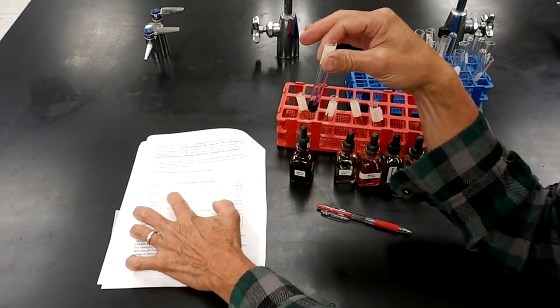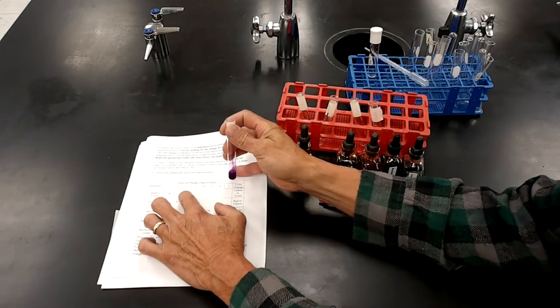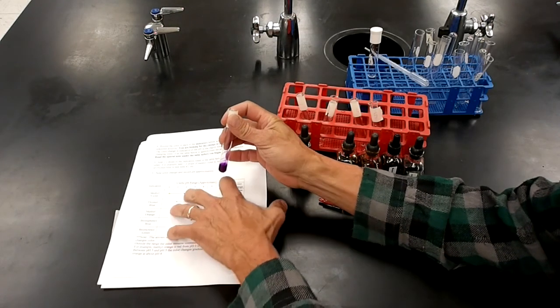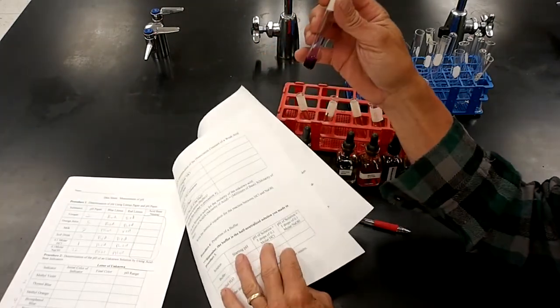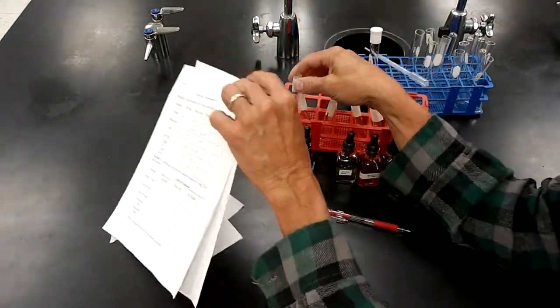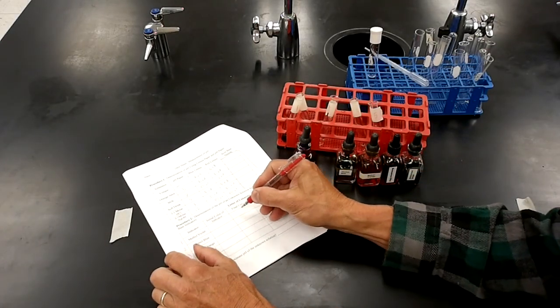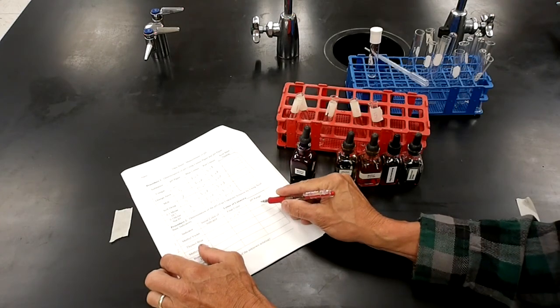It's going to be yellow at a very acidic pH, say below 1. It's going to be violet from a pH of 2 up to 7. So look at that. That's definitely violet. So what we'll do on my data sheet here, final color, violet.